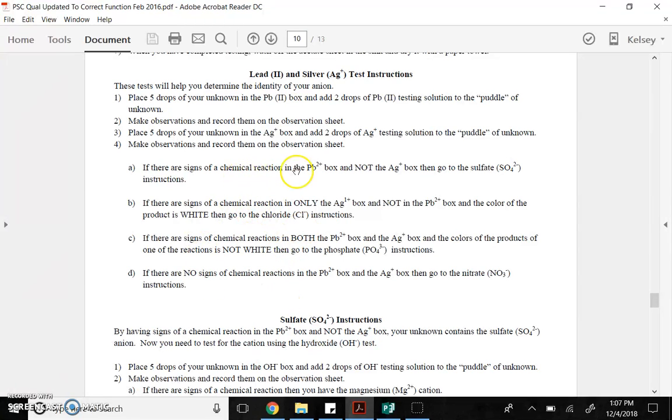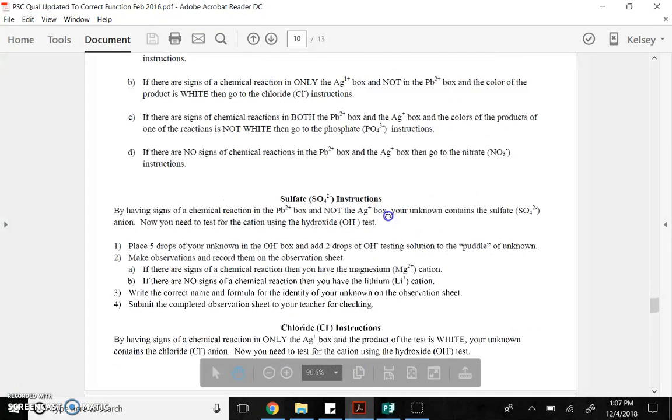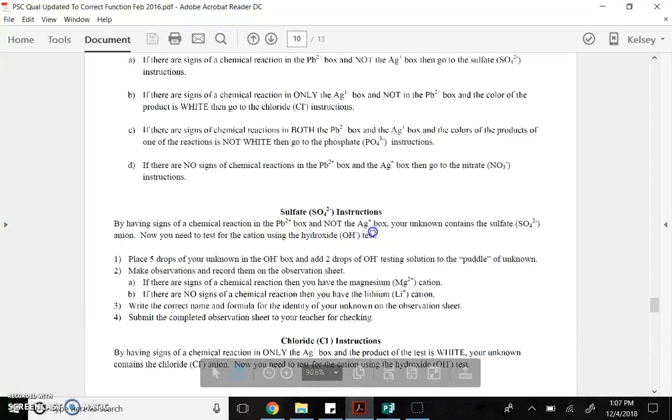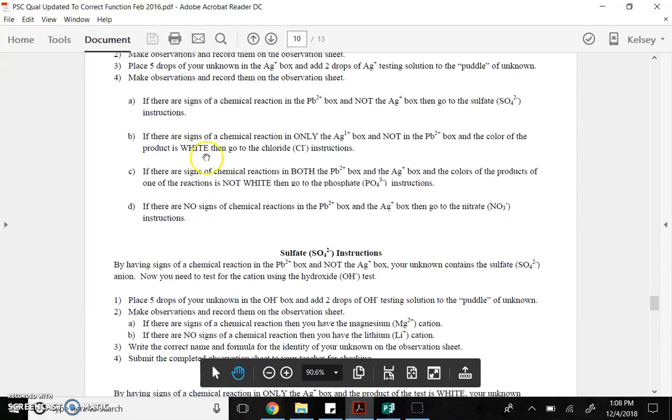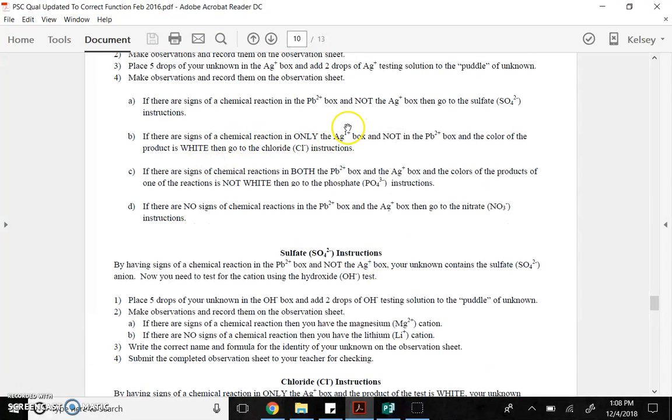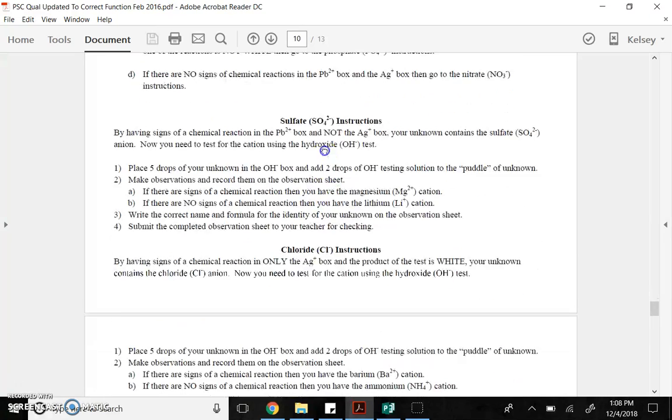You place five drops of your unknown in the lead box, and two drops of the lead testing solution into the puddle of the unknown. Make your observations. Record them in the information sheet. Then, you place drops of your unknown in the silver box, and then two drops of the silver testing solution. Make observations. Four things can happen.